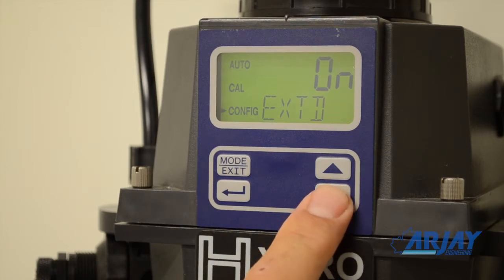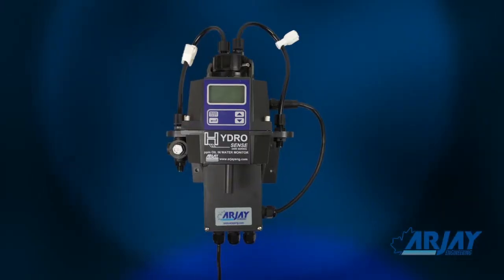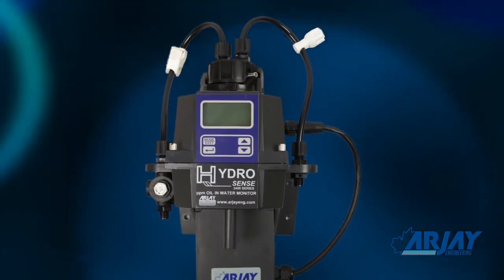Be sure a firm cleaning schedule is put into place. Take advantage of the unique RJ design that makes this a simple 2-minute procedure.